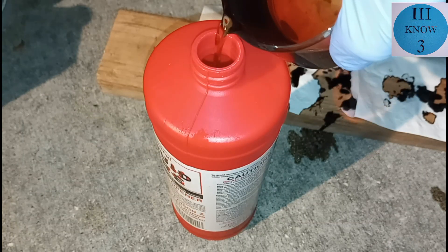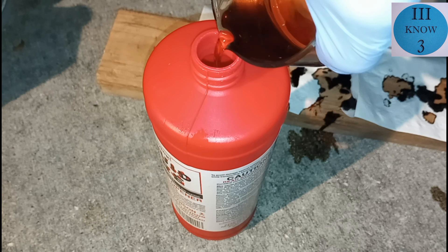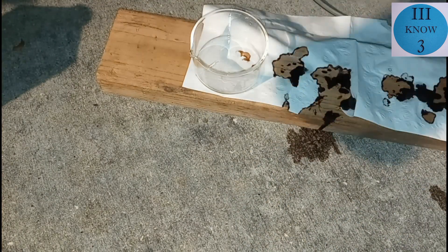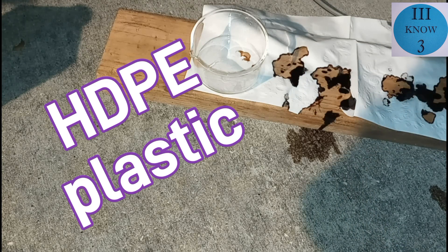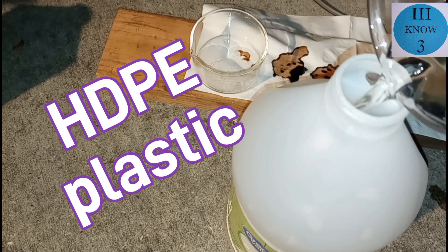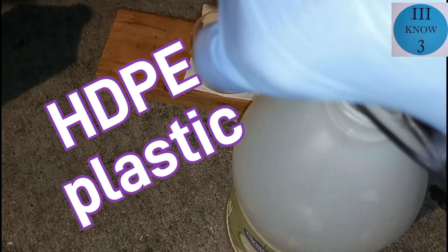We'll put the Liquid Fire back in its original container, and then we'll use this cleaning vinegar jug here, because it's HDPE plastic and it's already been used for an acid. So we'll store it in there and just change the label a little bit.